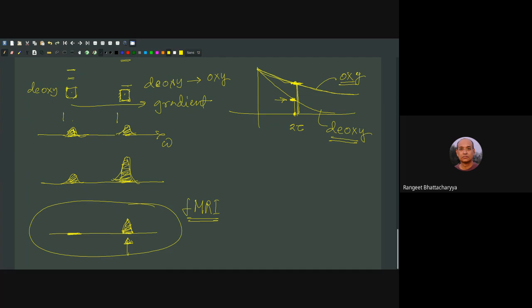Of course, in our lab in Kolkata, such simple 1D spectrum, and particularly 1D images, where we have a different kind of sample, something here and something else there with different T2 values, we have actually recorded that. So it's not just a test situation for the sake of taking the class.